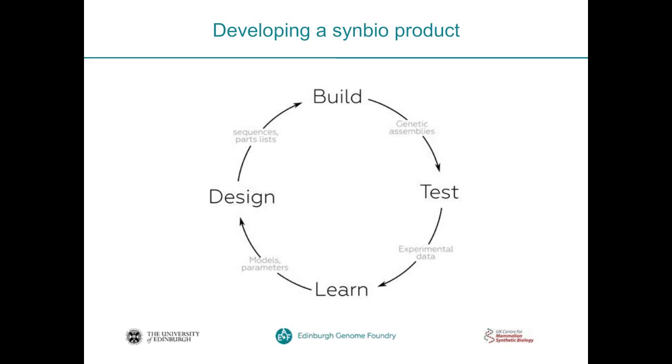In the build phase, the circuits are assembled from parts, using one of several available DNA assembly techniques. The assembled constructs are then quality controlled and examined for their function in the organism. This is also known as the test phase. The new experimental data then will be analyzed by bioinformaticians or systems biologists to refine models and estimations, and therefore expanding a knowledge base and allowing for better designs in the next iteration.